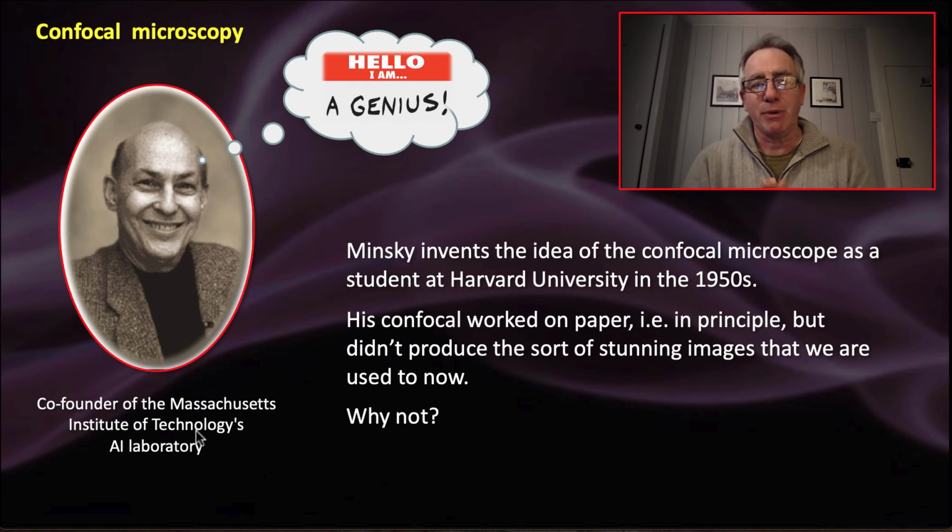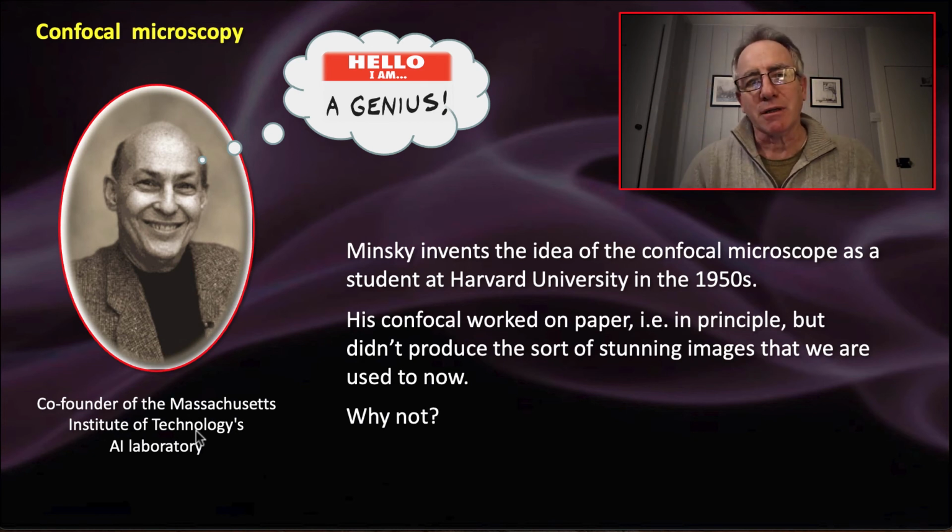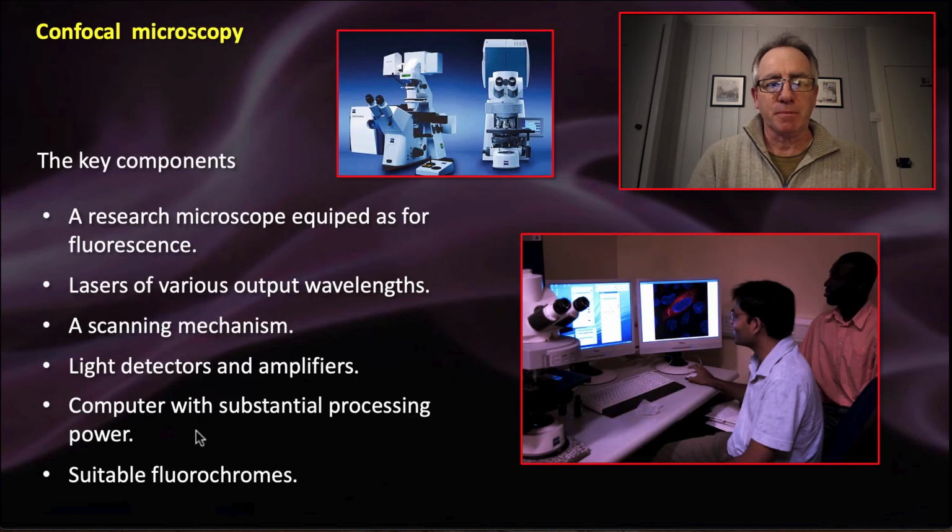But anyway, his PhD examining committee said that idea for that microscope that gives a super clear image really sounds good, but they couldn't build it. And the reason they couldn't build it, well, will become clear. Let's move on. So here are confocal microscopes.